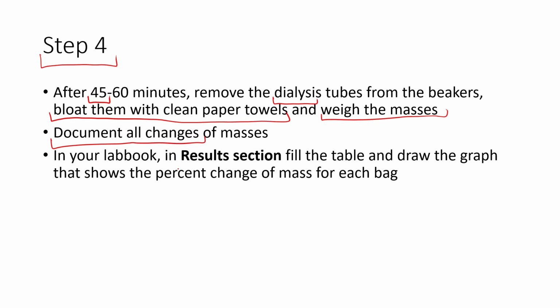In your lab books, in the results section, you will have your table with all these changes, and also you will be drawing the graph that shows the percent change of the mass related to the concentrations of these solutions. So that is it.